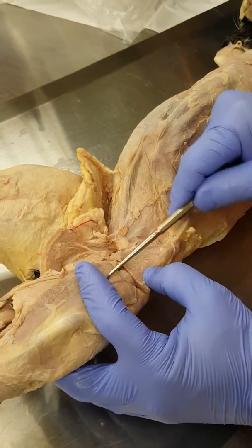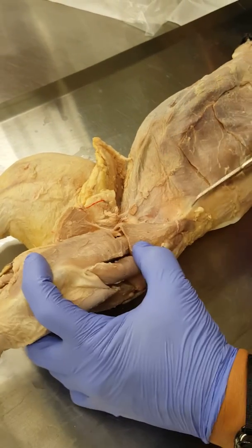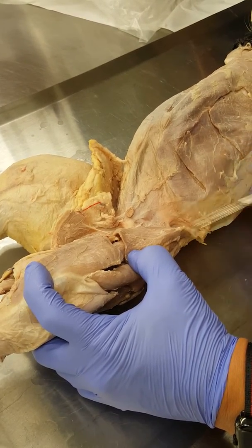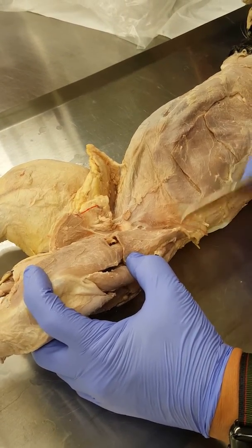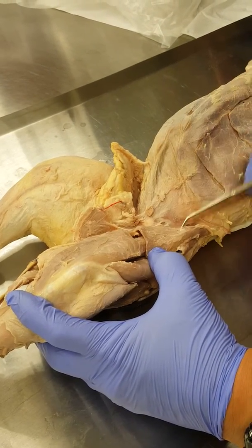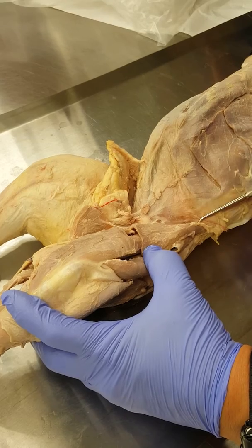Right? And we've cut through it so we can see deeper, but there's sartorius coming off of the crest of the ilium right here. Right? So it's coming off the crest of the ilium right there, and it goes all the way down to the medial surface of the tibia right there. So that's sartorius. On the human, it'll be a lot thinner, right?